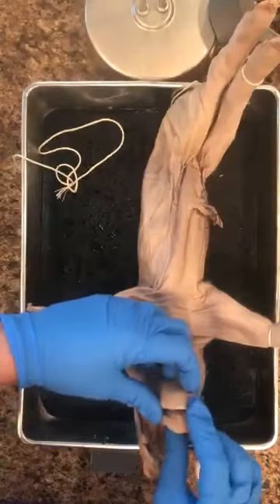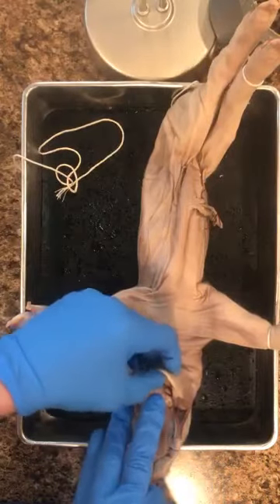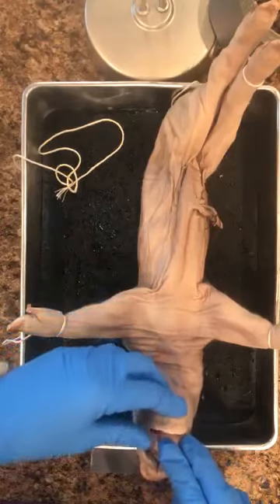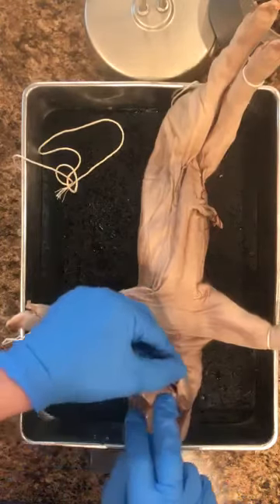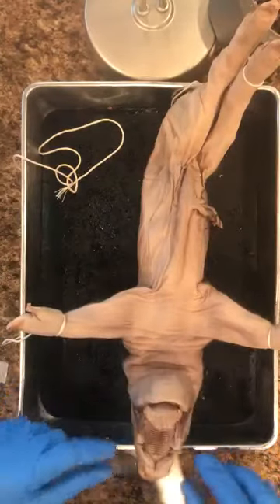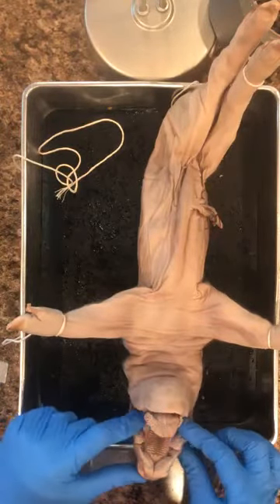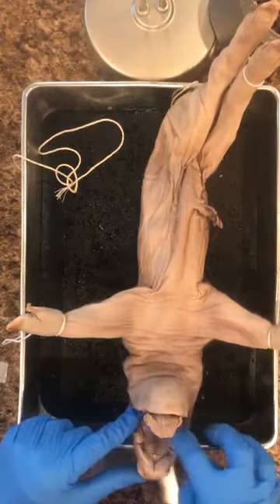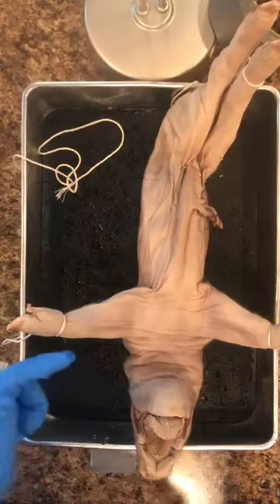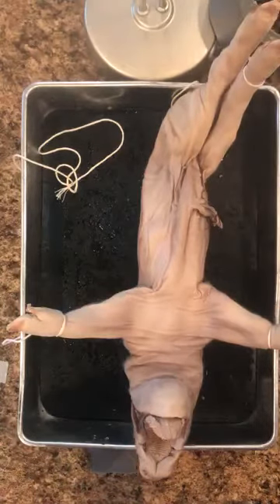And then here is the tongue. Okay, tongue's a little stiff. We got rigor mortis going on here. But there are also very sharp teeth down here. Not all of the teeth are sharp. In fact, the frontal teeth are flatter because the pig is the omnivore, so it's going to eat plants and meat. But these teeth on the side, there are two really prickly ones right here, and on the side up here, whereas the frontal teeth are flatter. There are teeth coming in right here. They are not through the roof of the mouth yet, but they would be like molars. They are also a lot flatter. Okay, so that is the mouth.